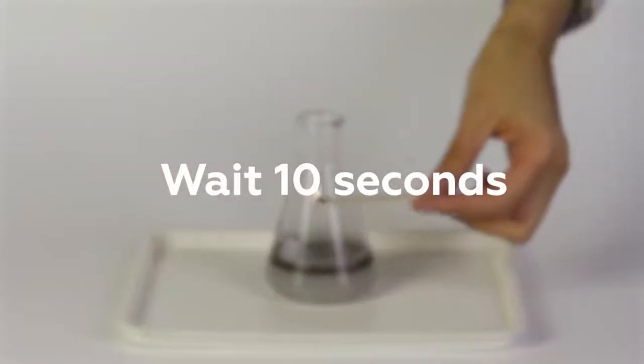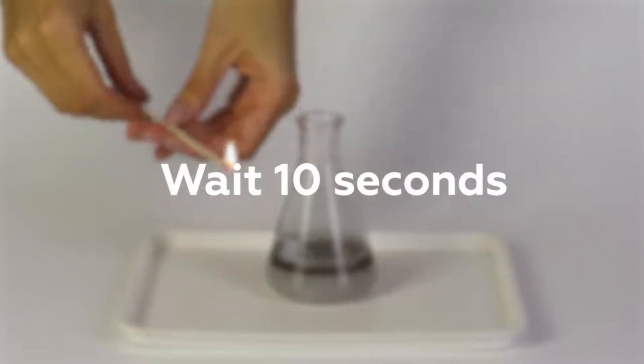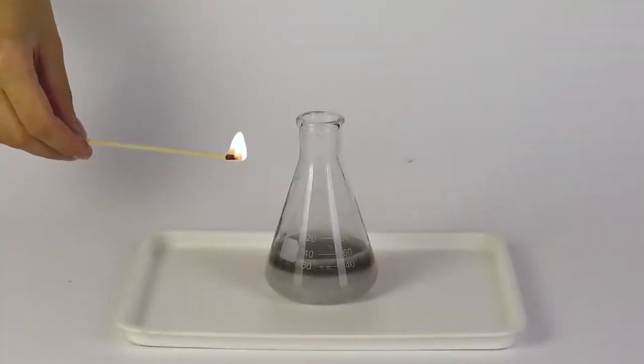Now take the gloves off and ignite the splint. Let it burn for 10 seconds and then blow it out. The splint will be smoldering.